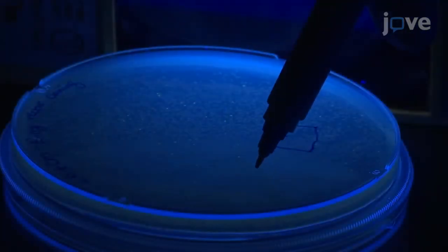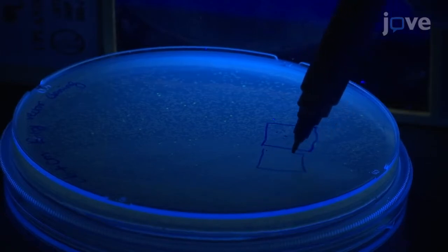To screen the plate, place it on an ultraviolet or blue light transilluminator. The SFGFP containing colonies will fluoresce under the UV light.